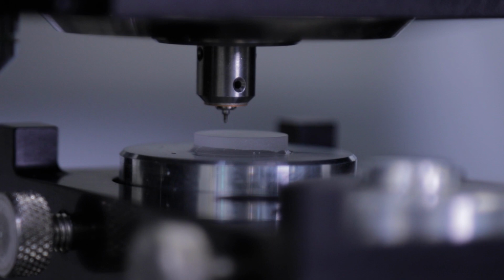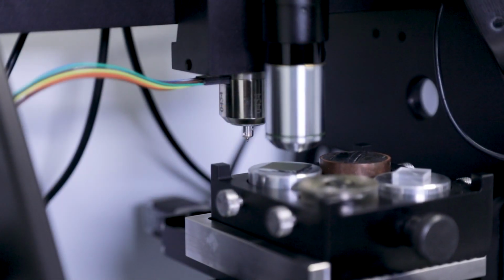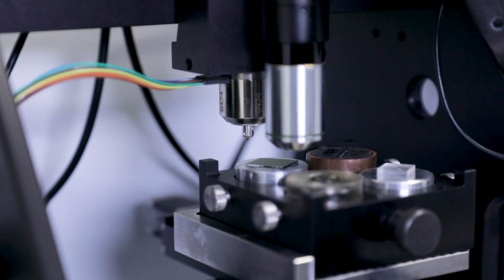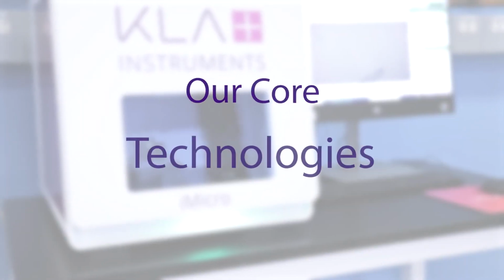And those are frequently considered in semiconductor. For semiconductor specifically, we're looking at the mechanical properties of thin films and adhesion analysis for optimization improvement of buffer layers. What separates us is our core technology.